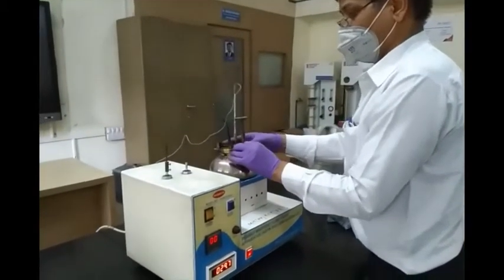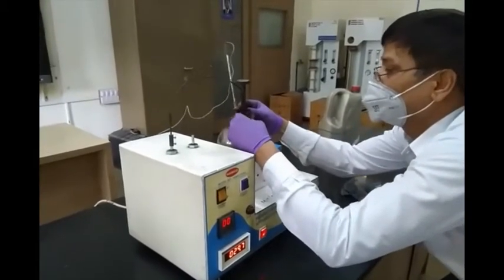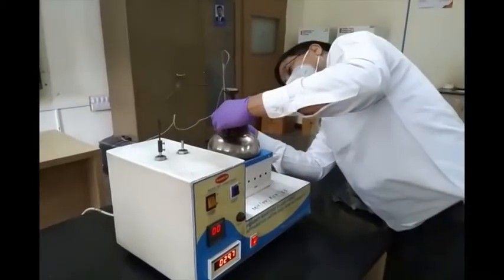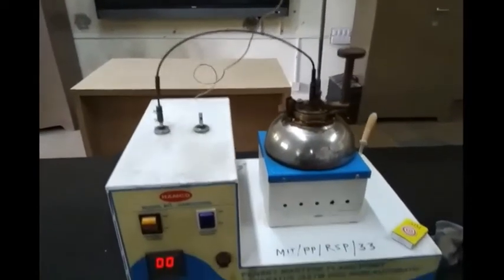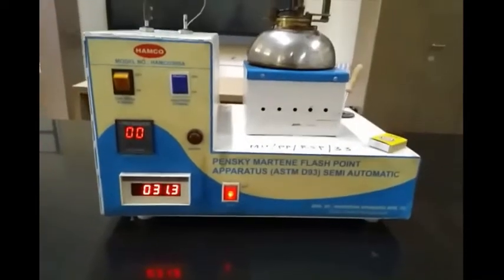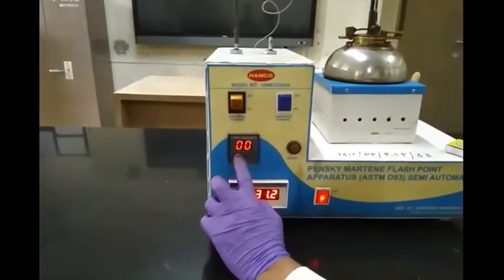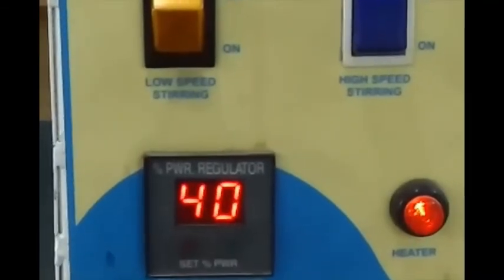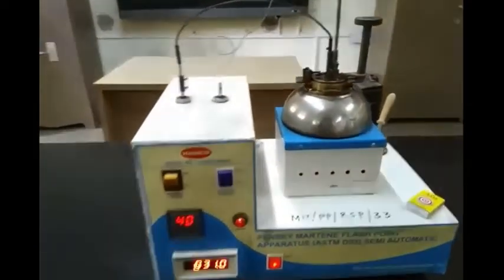We have switched on the power of the apparatus. As we can observe at the bottom, the temperature currently is 29.6 degrees Celsius. Once this arrangement is done, we start the stirrer. Now we put on the heater. The heater power is adjusted on the power regulator so that we get a uniform heating rate. Currently we are putting it at 40% of the maximum load. Temperature is currently 31 degrees Celsius.